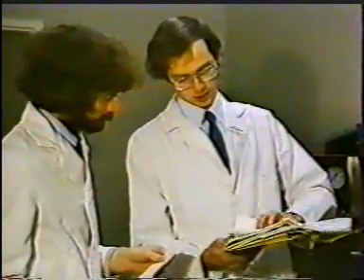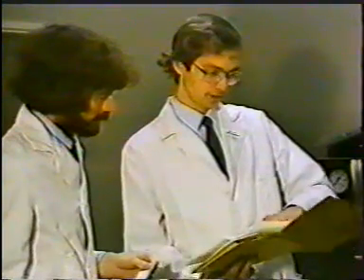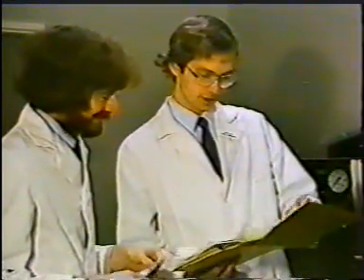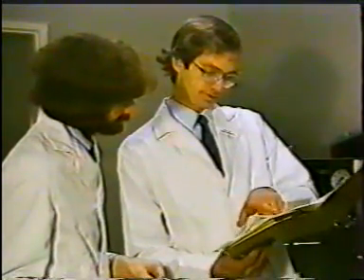It is necessary to ensure that pharmaceutical products are consistently made to the standard required. The procedures carried out in both the production unit and the quality control laboratory to achieve this are called good manufacturing practice, or GMP for short.